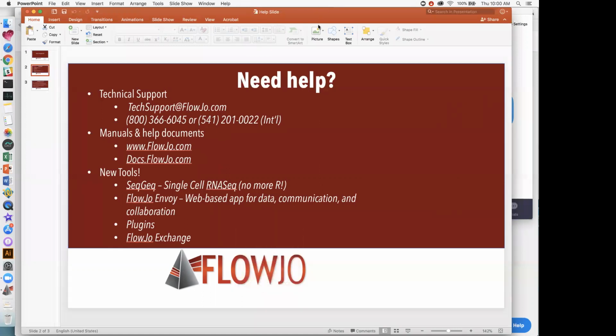I'm going to start recording this webinar, but today's webinar is going to cover the cell cycle platform in FlowJo.